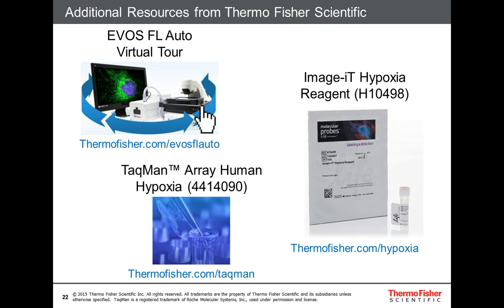Do you believe that the academic and pharma industry is finally coming around to the idea of culturing and carrying out experiments under low oxygen to better reflect what is observed in vivo? I'd like to think so. That's part of the purpose of my giving this presentation: to raise awareness and get people thinking about these questions, maybe in a way that they have either taken for granted or hadn't really appreciated as much. Given that oxygen affects just about everything, and you look at that list of genes, if you happen to be studying one of those pathways, then you might want to think about it.